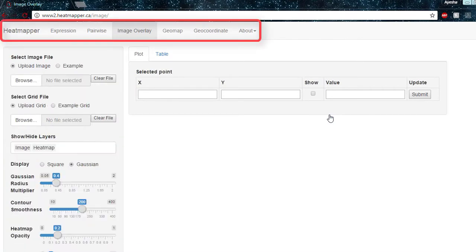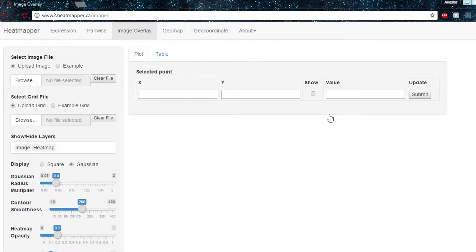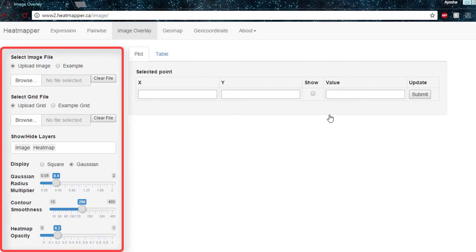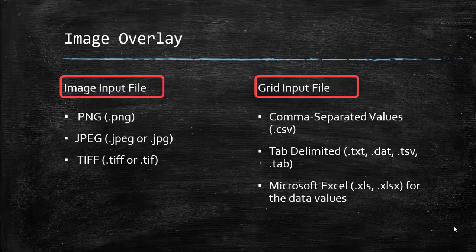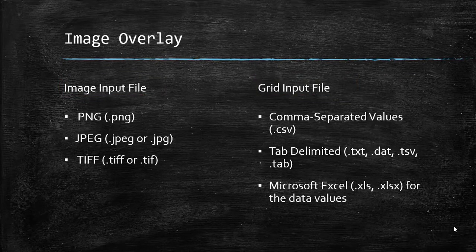The header inside the image overlay function allows the user to navigate to any of the other Heatmapper functions. The menu on the left allows customization of the heatmap. Before we can try to edit a heatmap, however, we have to create one. This heatmapper function requires two input files: an image file and a grid file to superimpose on it.